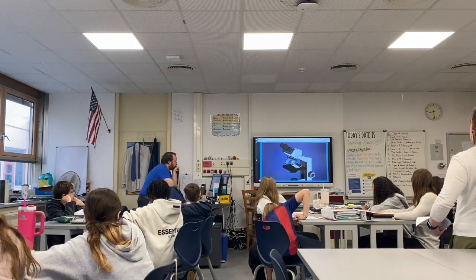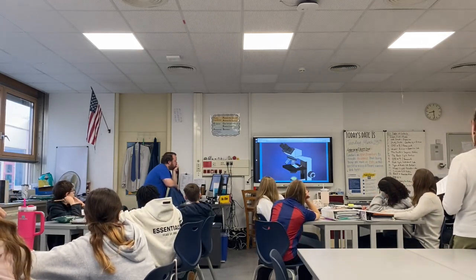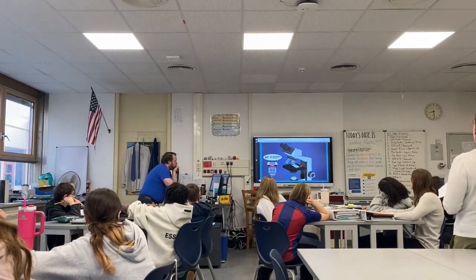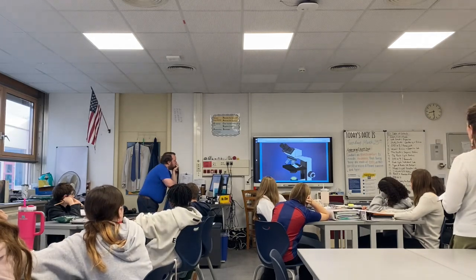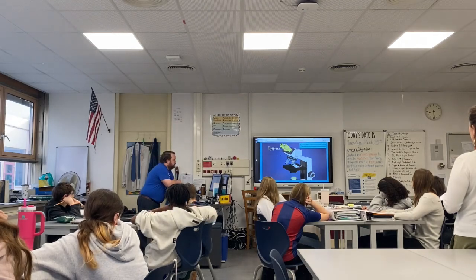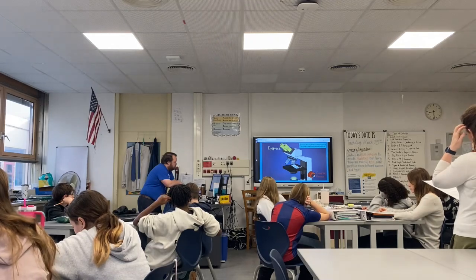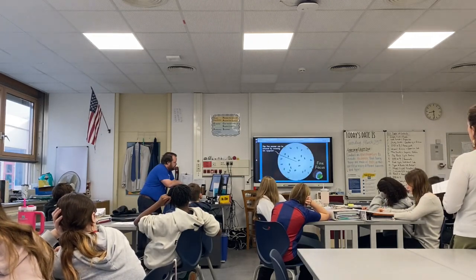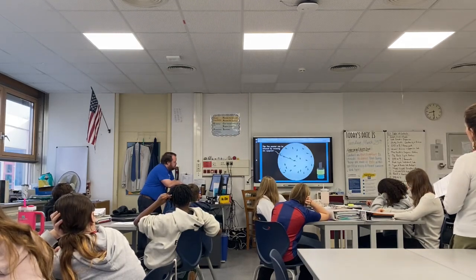I'm going to put the slide on the stage. I'm going to use the stage clips here to secure the slide. Light is on, and I already have the scanning objective lens here ready to go, which is good because I want to find the specimen first. I can adjust the light level if I want, but just know that super bright doesn't always mean the best image. I can look through the eyepiece and use the coarse focus knob to move the stage up or down slightly to focus. Patience. I can also fine-tune focus it with the fine focus knob. I can use the stage knobs to center my image.